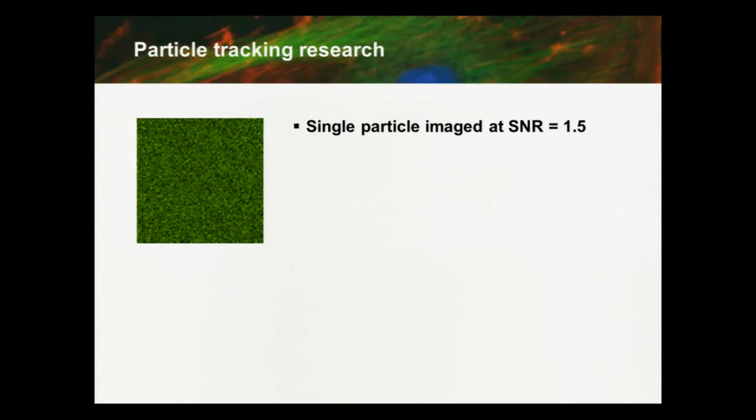So we did a lot of research on this. Can we improve on this? And I'm just going to show you some of the things that we've been working on, some of the things that we've thought about. Suppose my signal-to-noise ratio is 1.5, and this happens a lot in single-molecule studies.